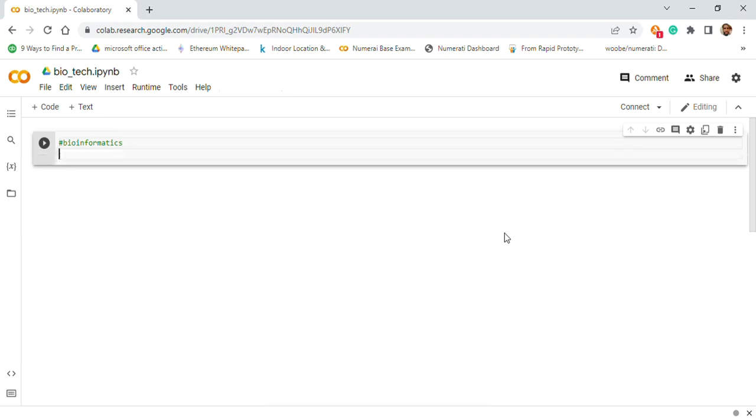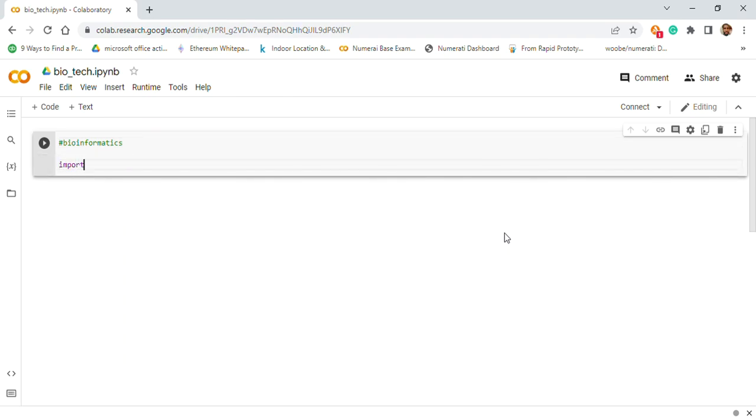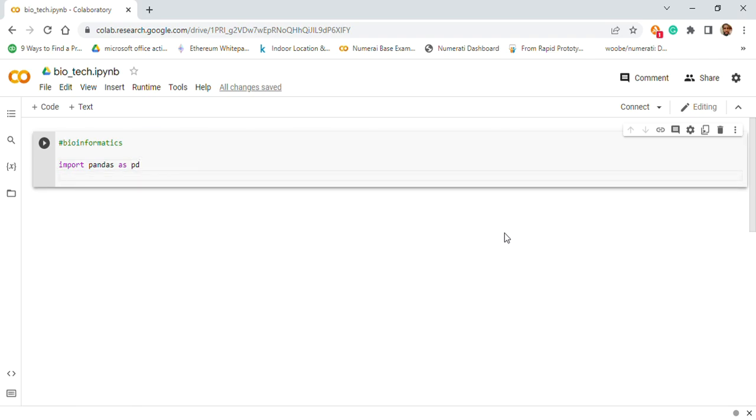So this is one of the main tools you are going to make use of. Pandas is for data analysis. So we are going to import it, and then maybe we'll check the version that we have of Pandas. This is how we check for the version.